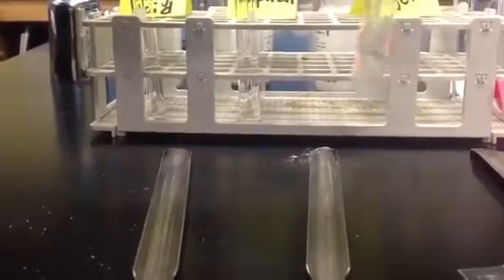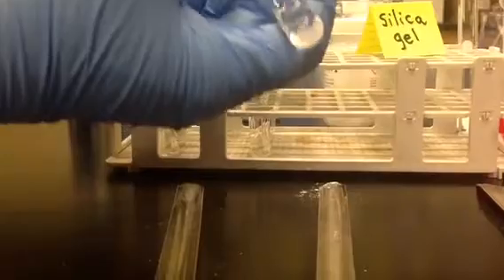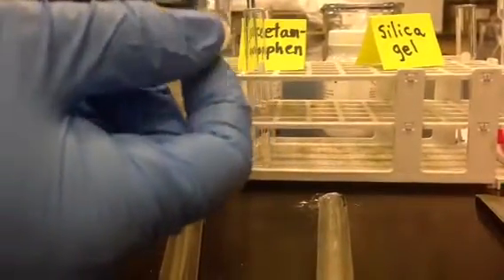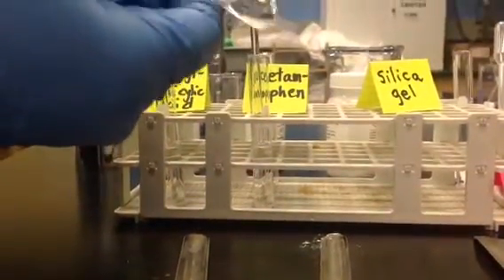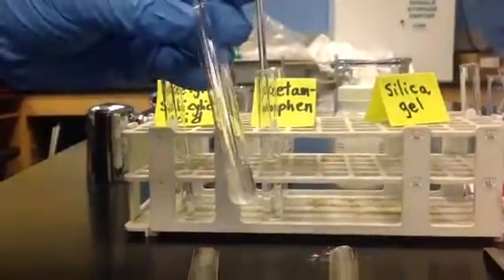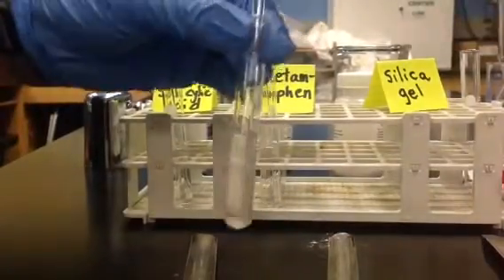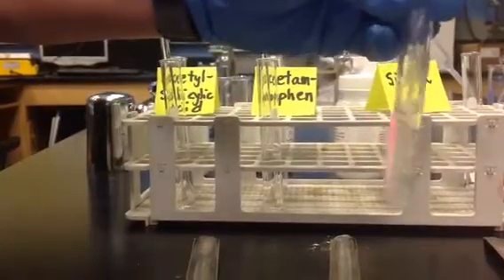So I've added more silica gel, and you can see that no, it's just kind of like a solid right there. That's a good angle there. You can see it mixing, but not dissolving. So I'm going to add another dropper full, stir it again, see if I can get any of it to go in.